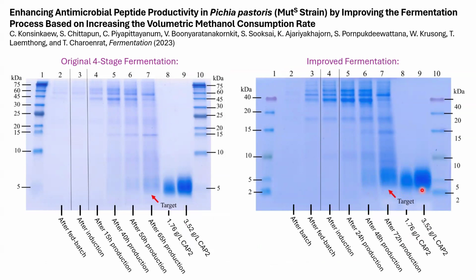However, they also highlight one major concern of this method. These contaminant proteins at higher molecular weight, as you can see in the gels, are qualitatively a higher concentration for the improved method, which aligns with previous knowledge that operating at a higher cell density will result in higher concentrations of protein impurities.